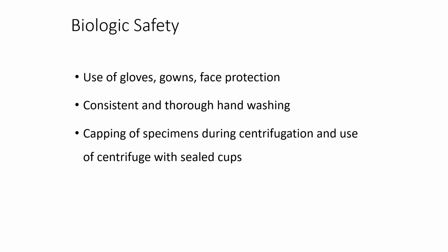But when you're dealing with blood specimens, it's always good practice to consistently wash your hands several times throughout the day, especially before and after breaks or meals. Cap specimens during centrifugation and use centrifuges with sealed cups, making sure those tubes are completely sealed before you put them into a centrifuge.